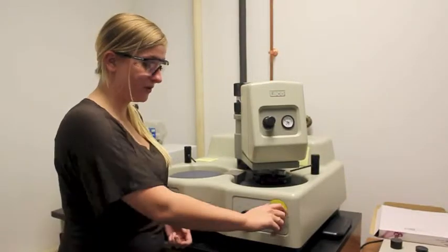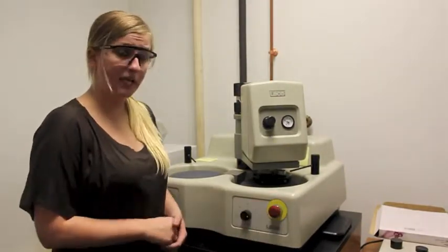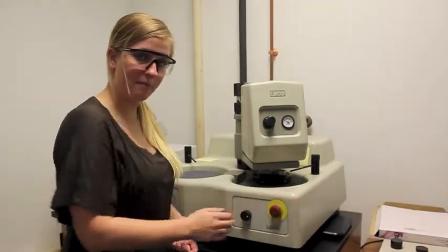In order to turn on the Spectrum System 1000, you want to rotate the red button clockwise. It will pop out and also serve as an emergency stop button.